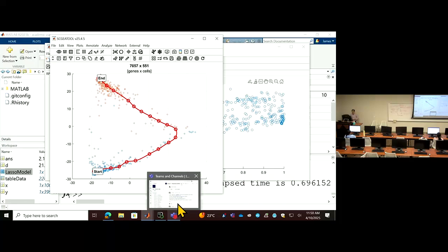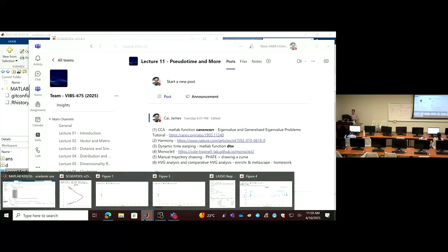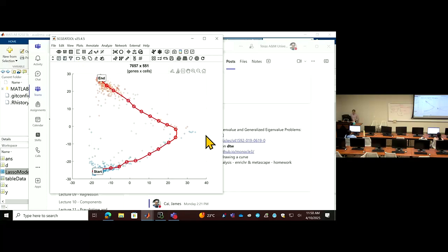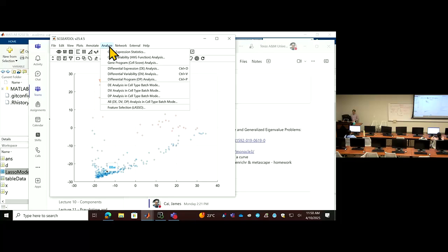The last step is I will very quickly show you again what your homework will look like. We can just use this as an example. We have the same population, the same cell type, just 2 different batches, okay? And then we want to find variability difference in some of the genes.